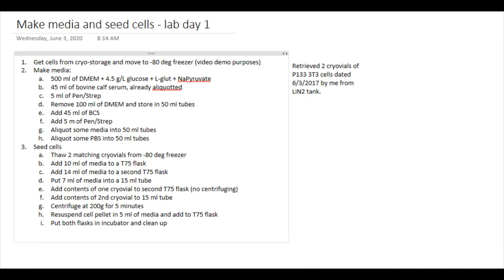The last thing I want to talk to you guys about today is lab notebooks. And so, like I said, you can either use a OneNote lab notebook or a physical lab notebook. I just want to show you what I would have done for today in my OneNote notebook. I would have summarized all the steps so that I could easily glance over and see, here are the things that I need to do. And then you can see off to the right here, I then have the results.